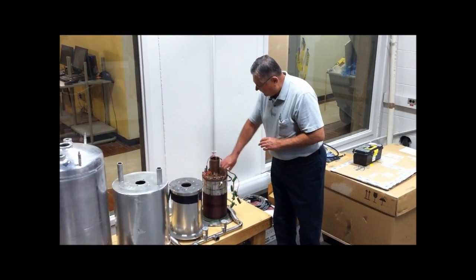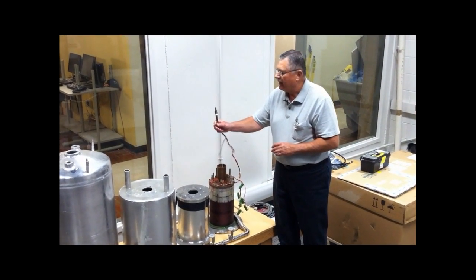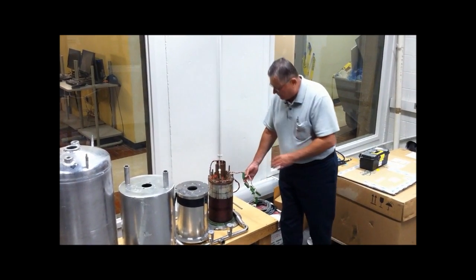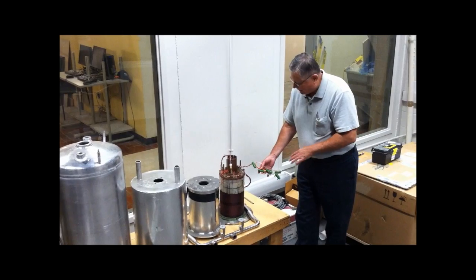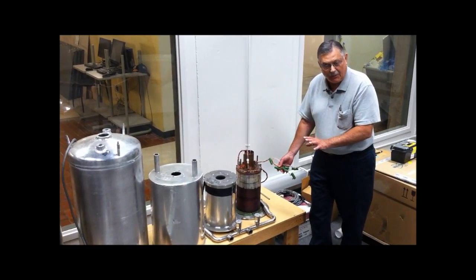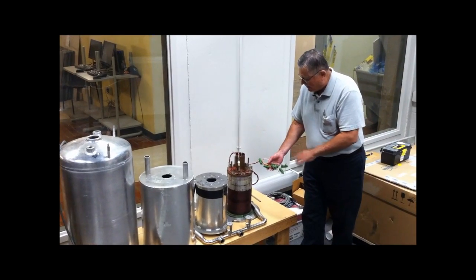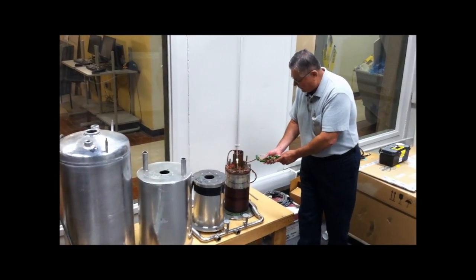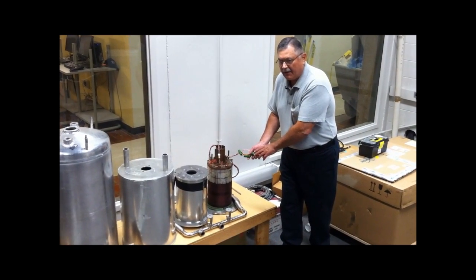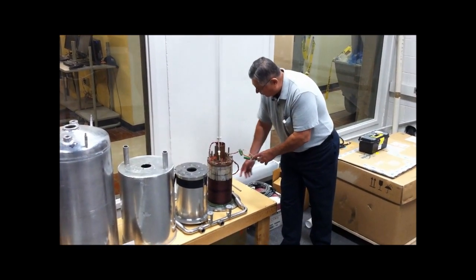These connections here are to energize the magnet. Because there's so much current in these magnets, in case you run out of helium and the coil warmed up, you could possibly burn it. So to prevent that, we have these large resistance networks here that take all the energy from that high current, so that we don't burn the superconducting wire.